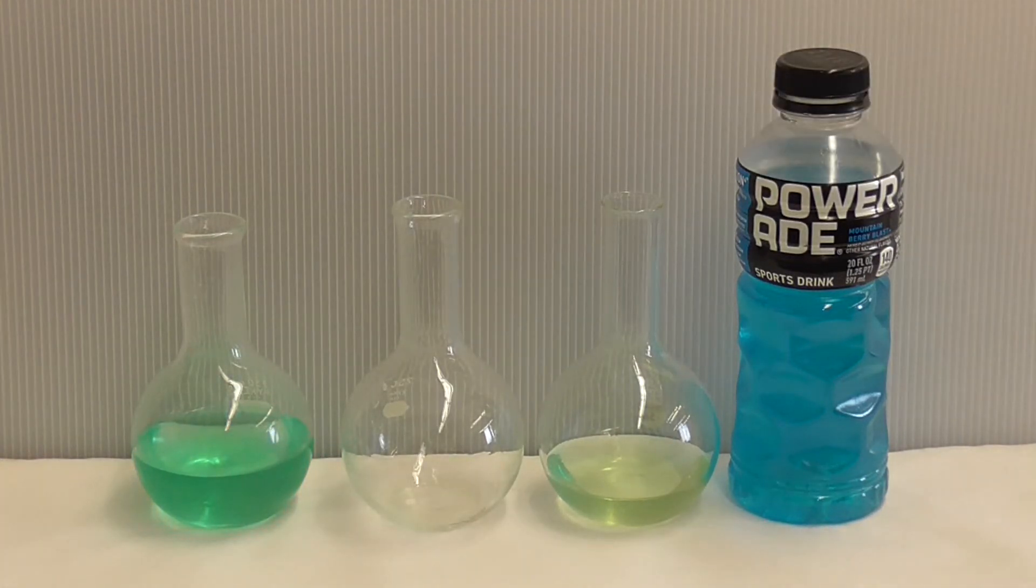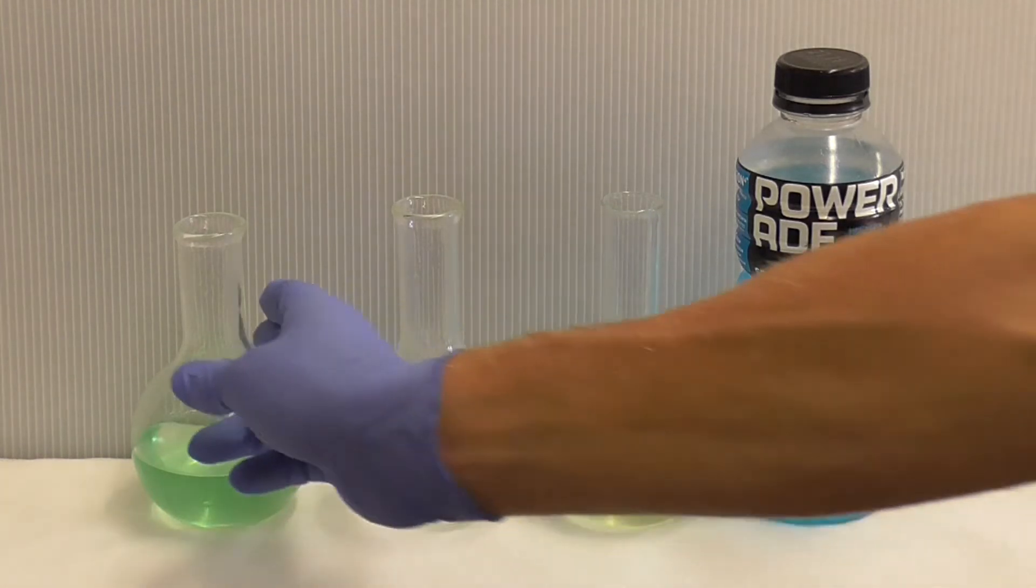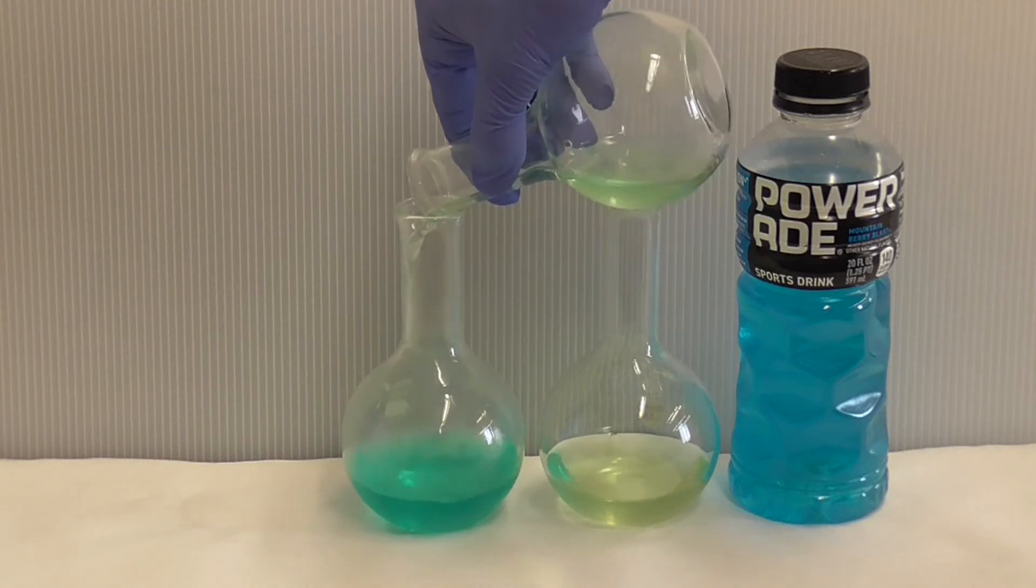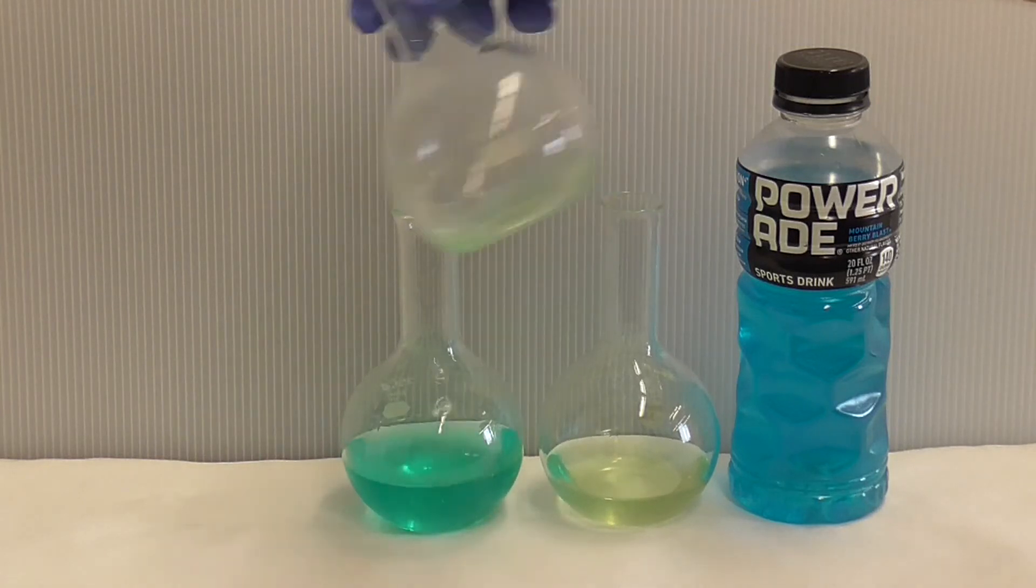That fades to green. This looks yellow. I'll go ahead and pour this back in the middle flask. Ha-ha! There's the blue color again! That's beautiful! It's like a greenish-blue now.